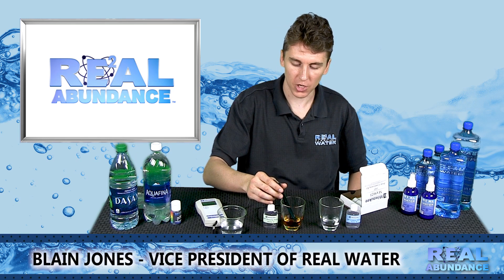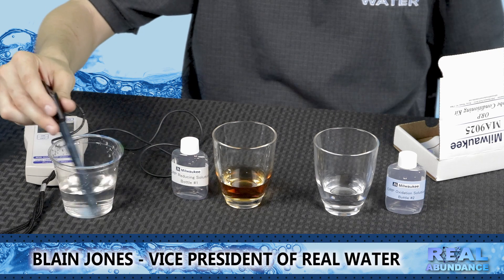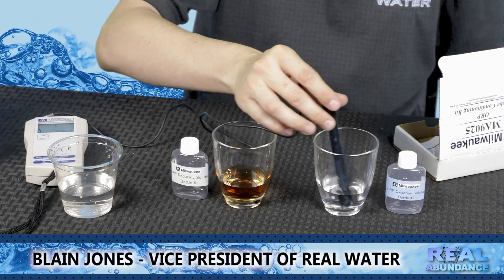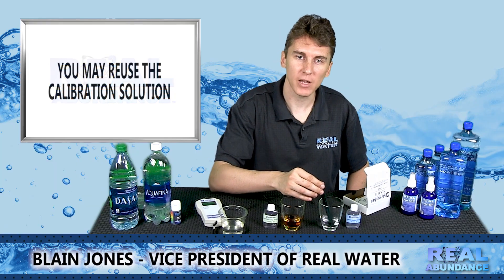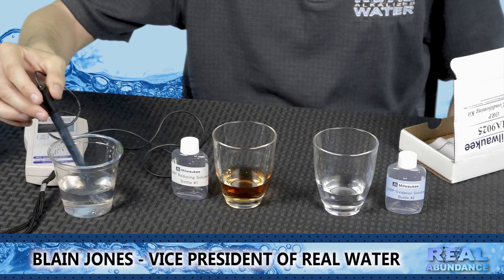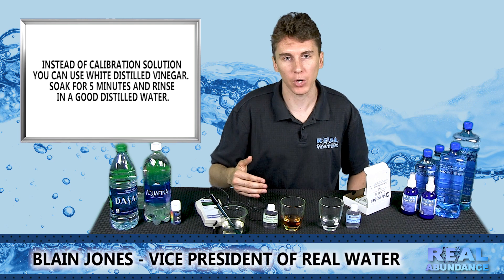After you have let the probe sit in solution number one for 60 seconds, take it out, allow the excess to drip off the end of the probe, and rinse in good clean water. Then place the probe in solution number two and mix as you go for about five minutes. After five minutes in solution number two, again allow the excess to come off the probe and rinse in good clean water. That is one cycle of the calibration process. You will need to do that at least two to three times when calibrating your probe.